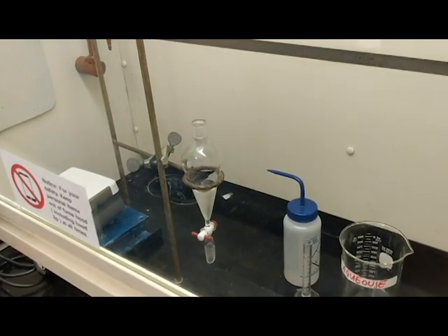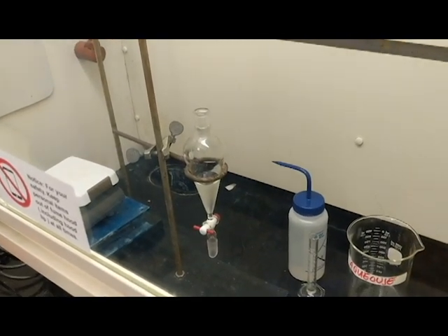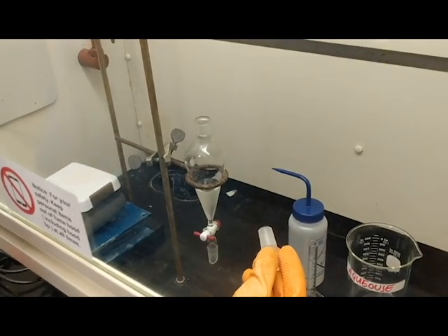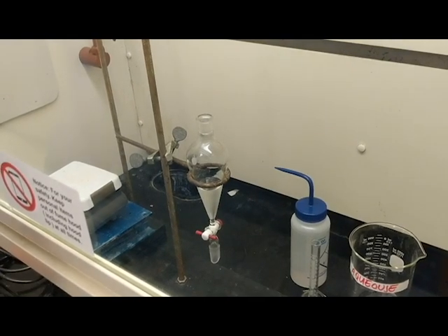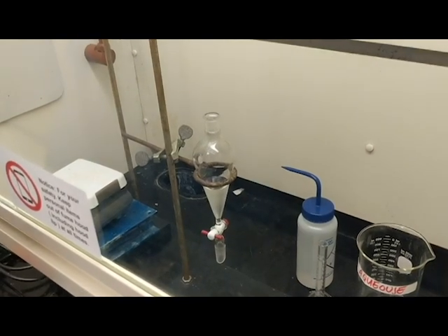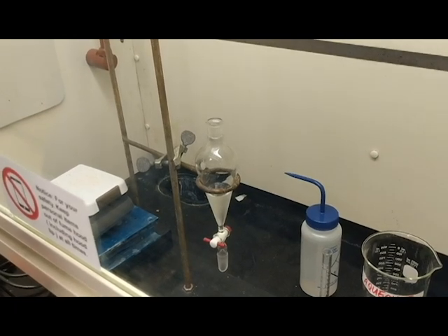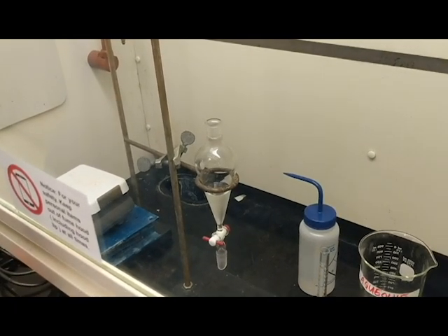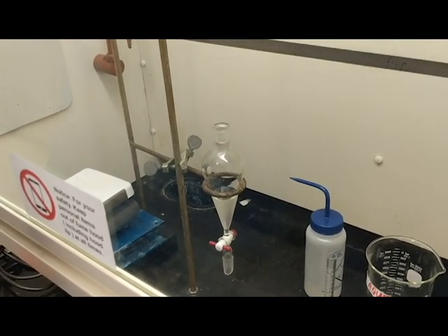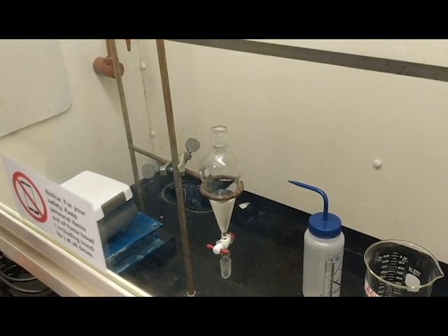So at this point, the next step in your procedure is to do an extraction by shaking the contents on the inside semi-vigorously with the cap on. When I do this, there's going to be a lot of vapor pressure that builds up inside the separatory funnel. We don't want to allow that vapor pressure to continually increase. That vapor pressure will cause this cap to pop off. In that case, the contents would spill out, they would end up in your hood, and they would end up on yourself. And this acid is very concentrated.